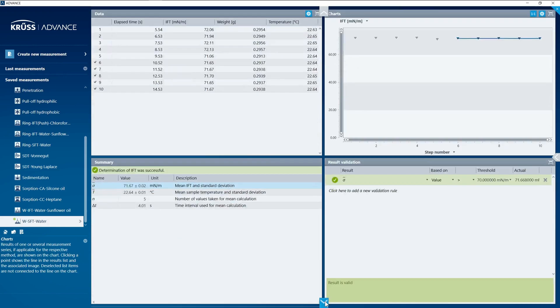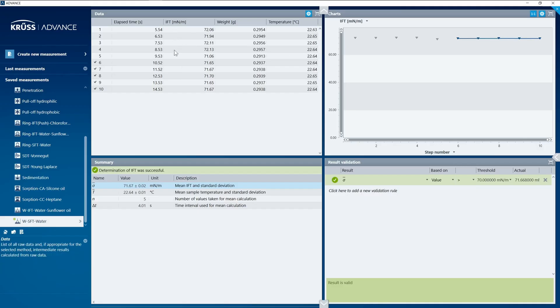If we go further down to the bottom, now we have everything that comes out after a measurement. So we have all of the measurement results plotted here in a table and here on a graph, and down here we can see now the summary.